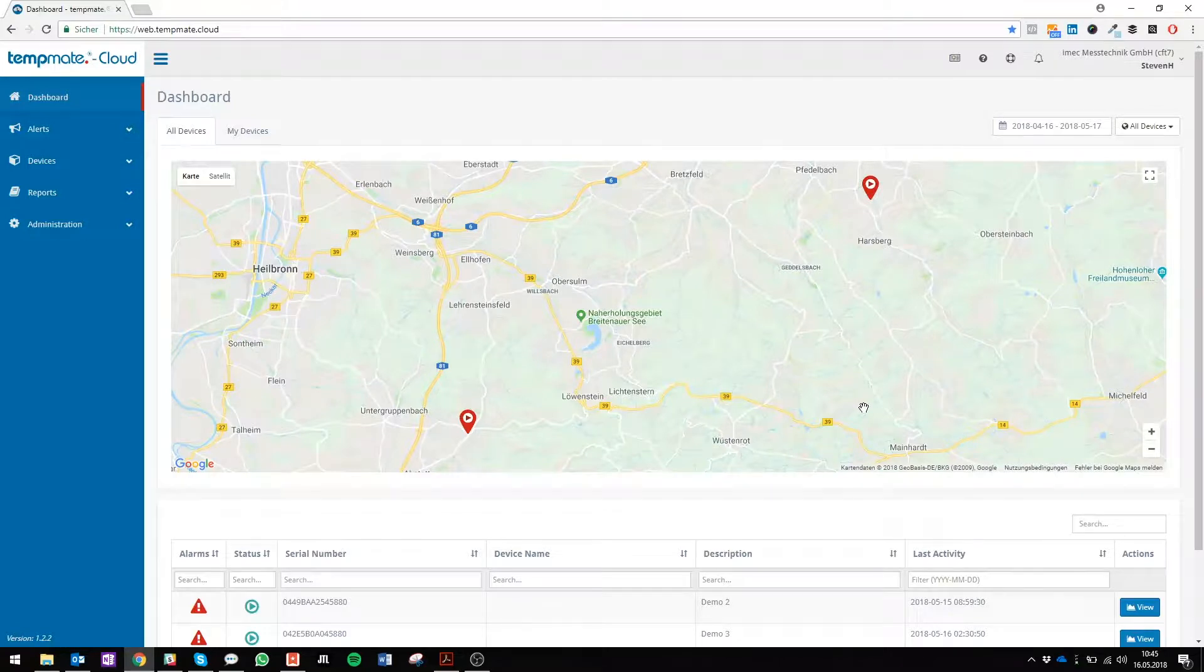Welcome back to our cloud tutorial. Today we're going to show you how to analyze your data.